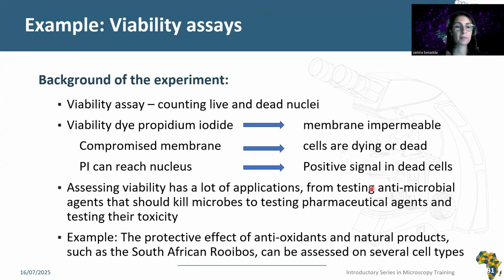So a popular experiment that we use is to measure the viability of your cells. So it's important to count the cells, for example. So counting the viability of the cells is very important for a lot of applications.